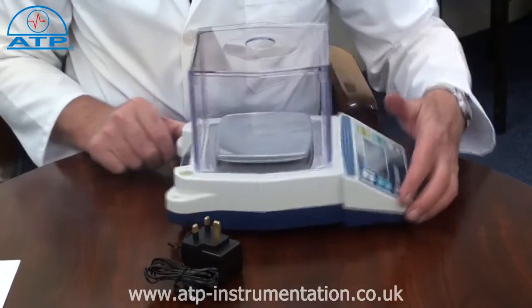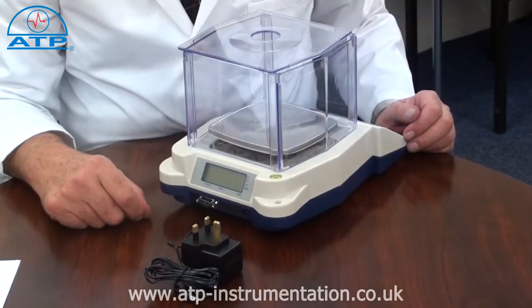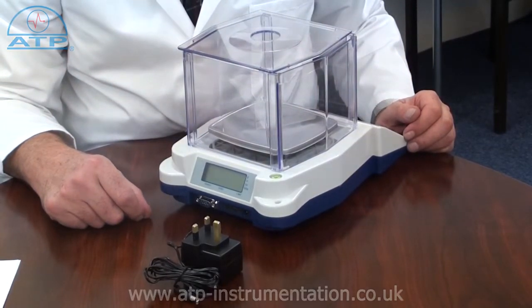There is a second LCD display on the rear of the scale. Both displays have a backlight which is automatic and activates when an item is placed on the platform.